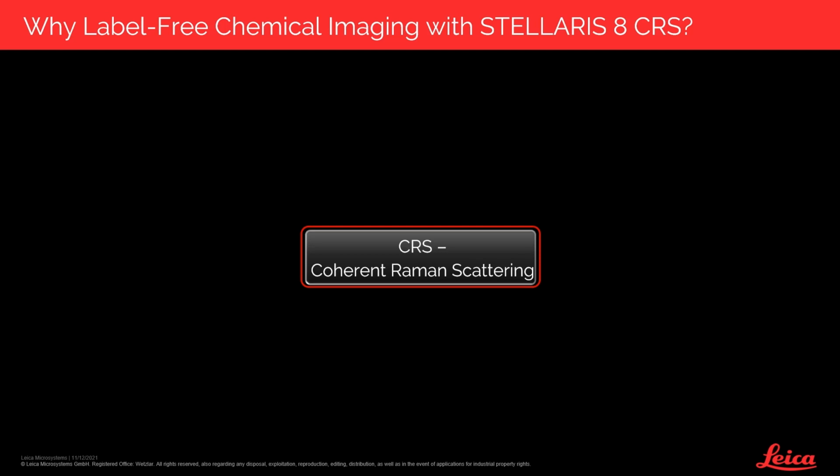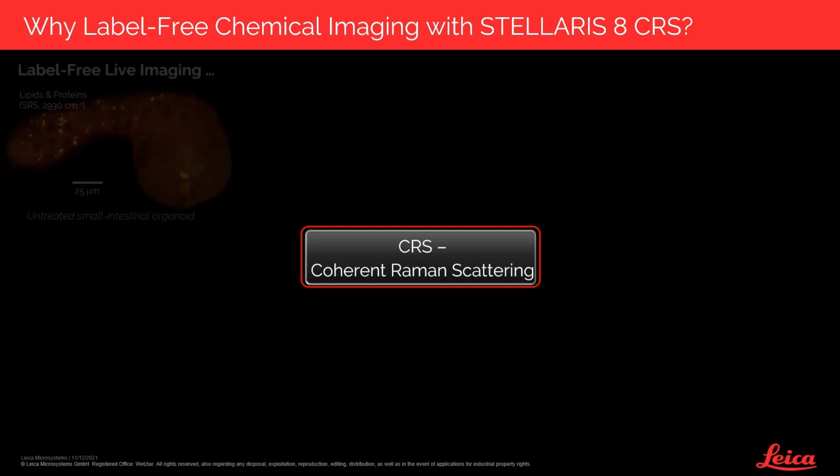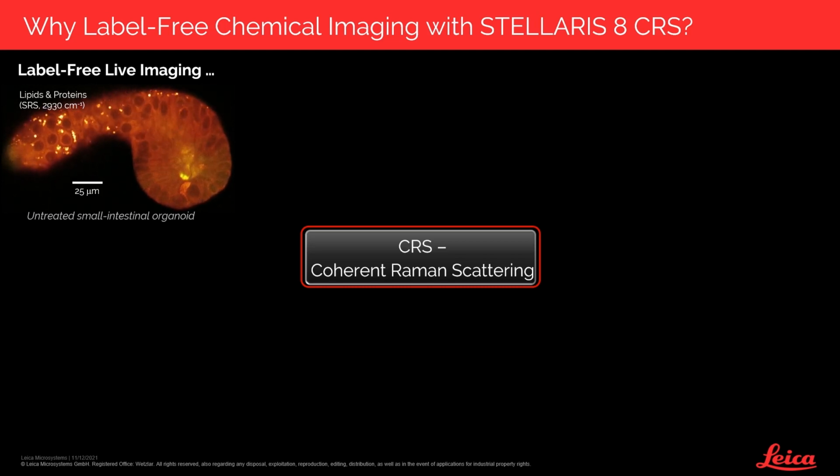So what can our customers do with label-free chemical imaging on the STELLARIS 8 CRS? They can do live imaging in cells and organoids without any need for labeling, with zero photobleaching and with minimal phototoxicity, and yet with a very high degree of chemical specificity. The movie shown here is a time-lapse showing contrast from both proteins and lipids in a single shot. This provides a nice overview of the major biochemical components in this sample.